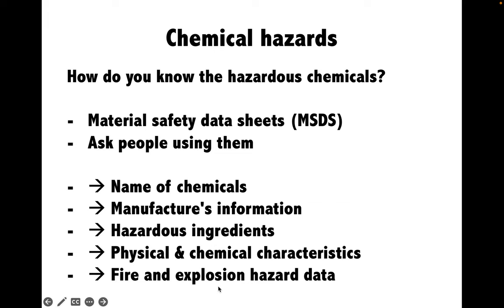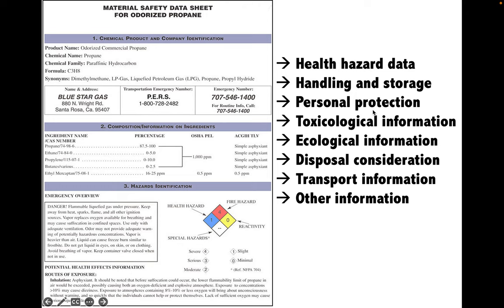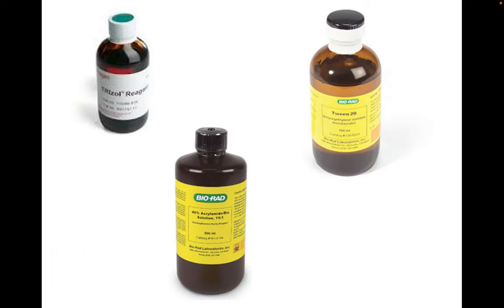The MSDS also includes fire and explosion hazard data, health hazard data, handling and storage, personal protection, toxicological information, ecological information, disposal considerations, transport information and other information. You can also learn from the labels on the containers of the chemicals as well.